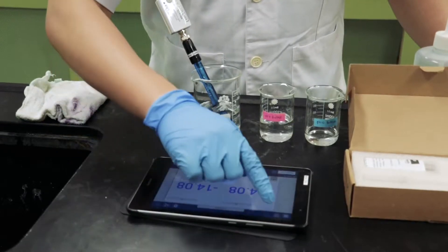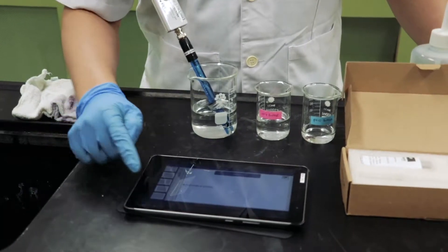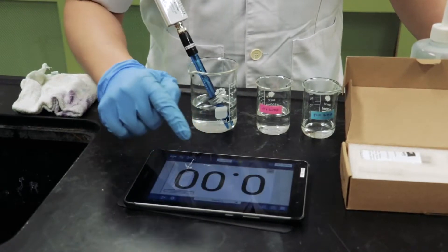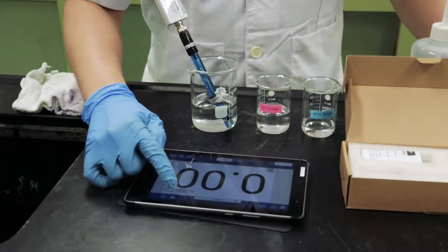Select Build a New Experiment and select your desired layout. Select the Select Measurement option and choose the PH Probe with the correct seal number.